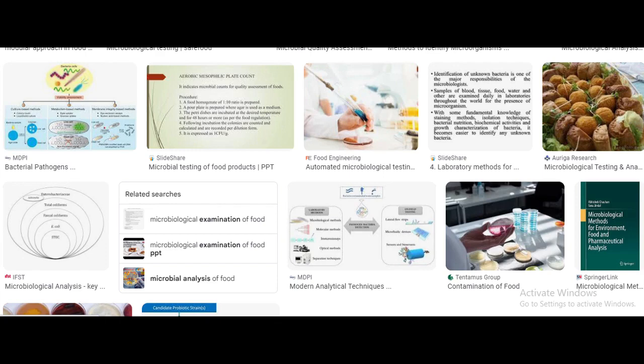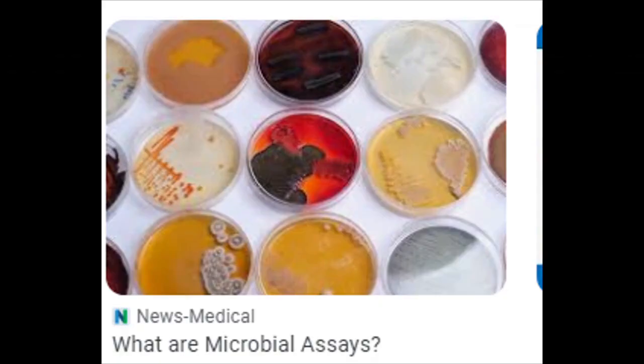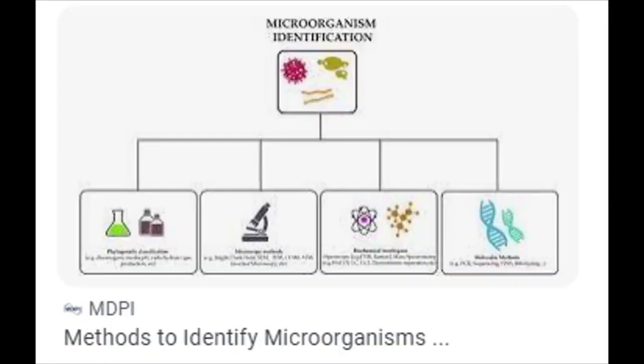The next one, apart from that, is electrical methods. When you plug some things in, some chemical signals come out, you read your score there immediately, and you go on with that. My data is used up, but let's see. Apart from the electrical method, I will send the material to you so you go over it. I will send it by email to one of you because I'm not sure the class is around. Then the ATP determination, I've said it before, so it's also here. You read over it. All these are rapid methods.